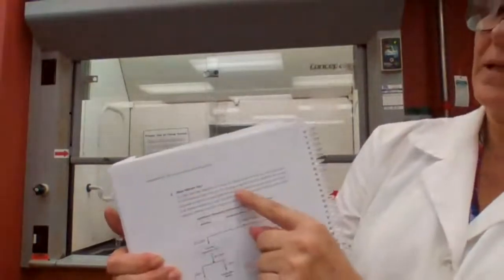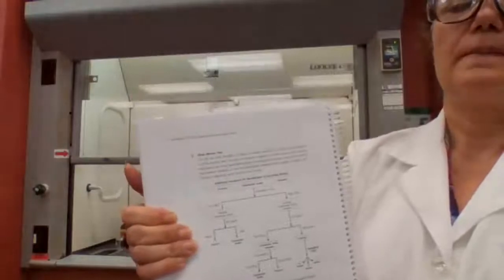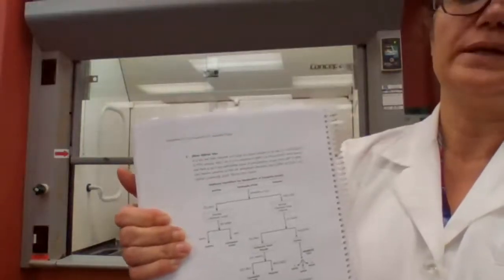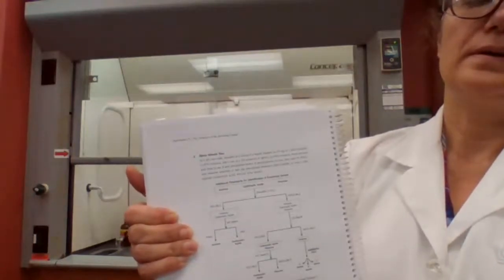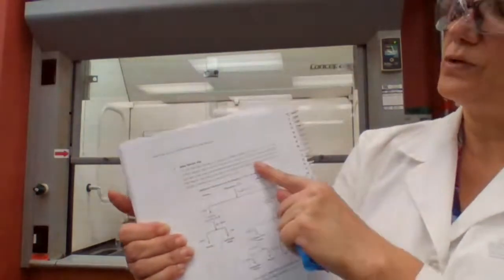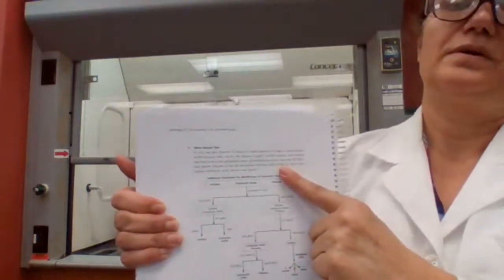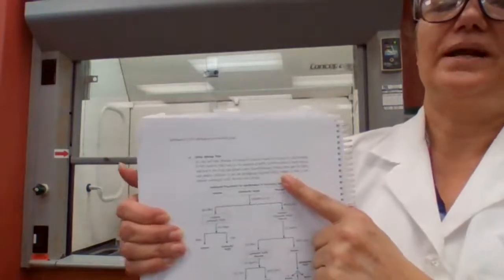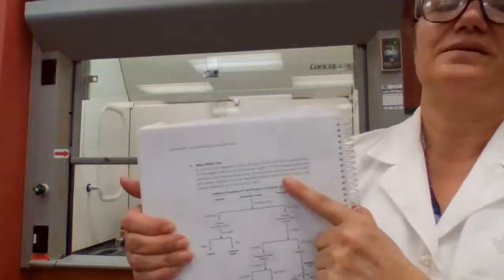The procedure is on page 222. An ebook would be 2 pages down, so 220. There is no sodium bicarbonate involved in that reaction. It's just the acid and silver nitrate, and all we do is add ethanol to dissolve it.